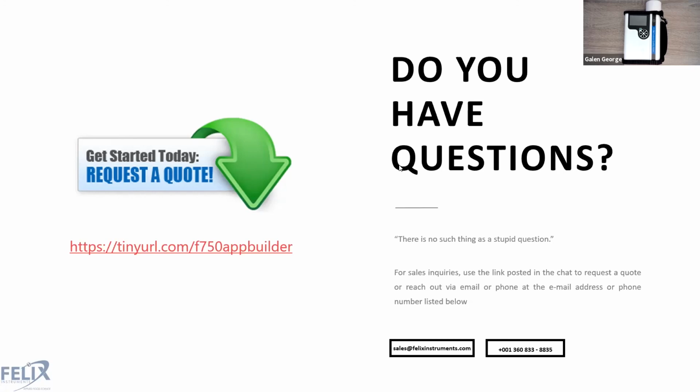And obviously a majority of the instruments out there are still Generation 1 instruments, and so we do still support Generation 1. But I will encourage you to upgrade if you can, because this new stuff opens up a whole new world of possibility with modeling.